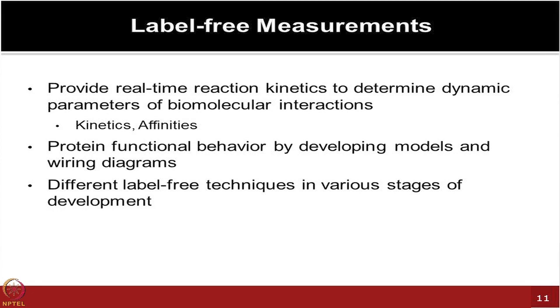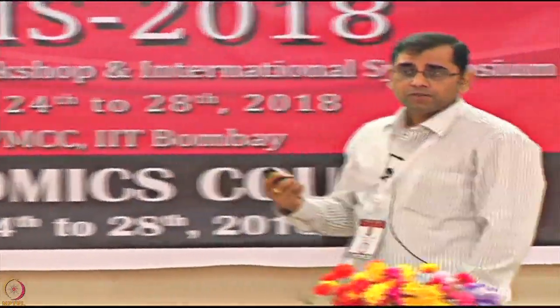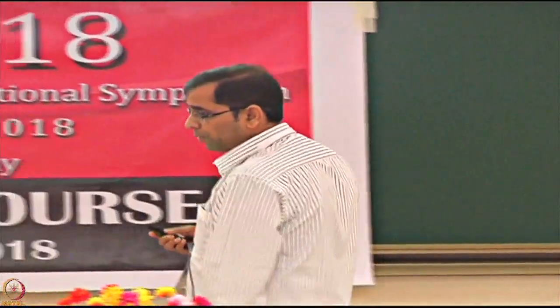So different types of label-free techniques, as I mentioned, are in various developmental phases. Of course, Biacore is pretty much leading in that way, because you already have over 20 years of the technology in the field. But many technologies are still emerging, including some of the biolayer interferometry based methods, which have come up really fast. Even MST technologies are emerging. So those could be good platforms to be used.